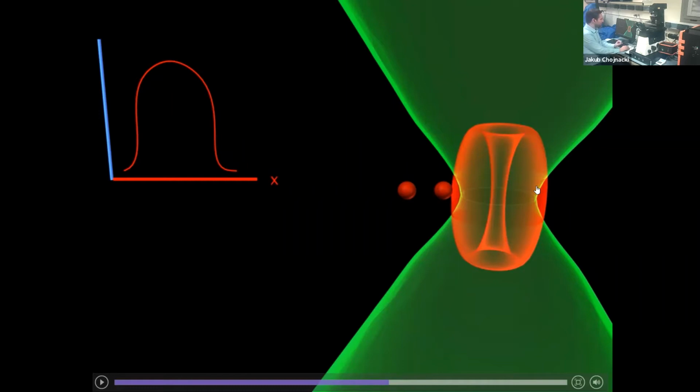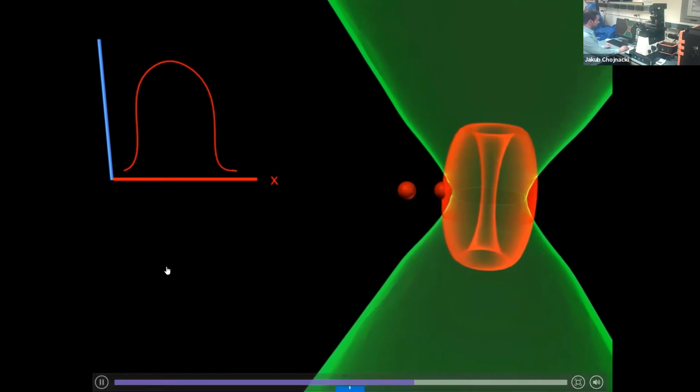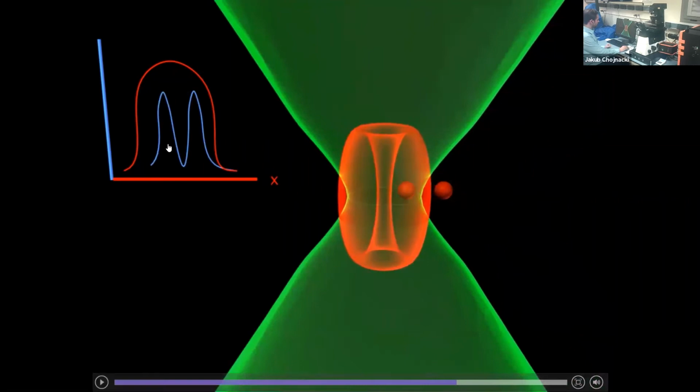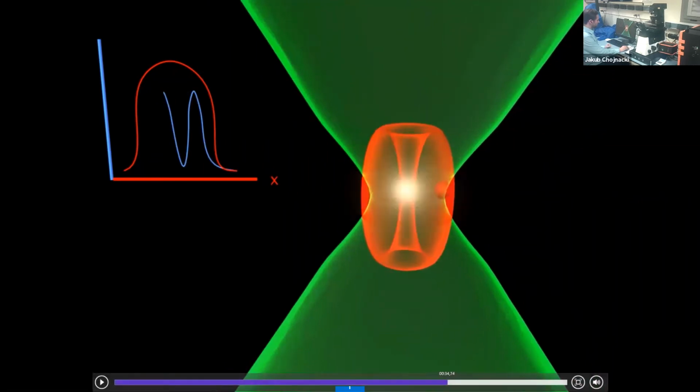So let's see what happens when we try to scan those 2 hypothetical points using STED microscopy. So the laser will scan again. And as you can see, I'll go back a little bit here. We start seeing that we can detect that there is a separation between those 2 molecules. Despite this molecule on the right being in the excitation field, it is depleted or inhibited by the second STED laser, and only the molecule that is present in the central 0 intensity in the middle is allowed to fluoresce.